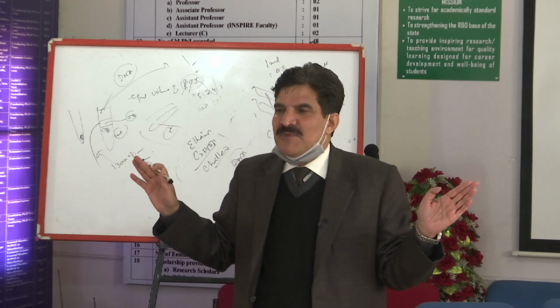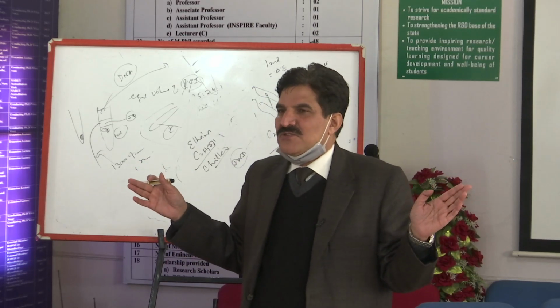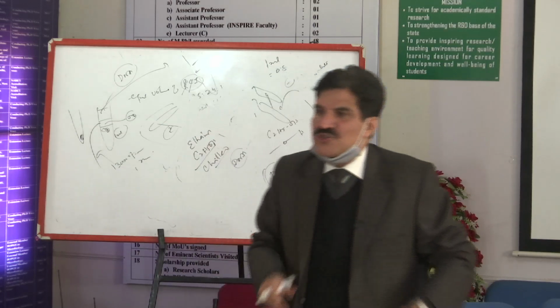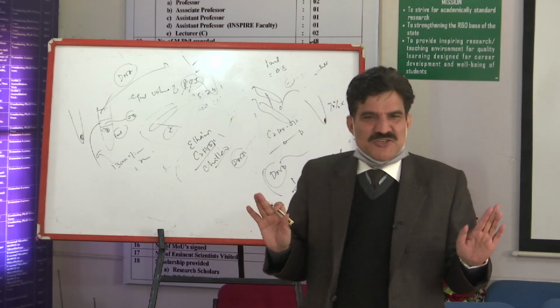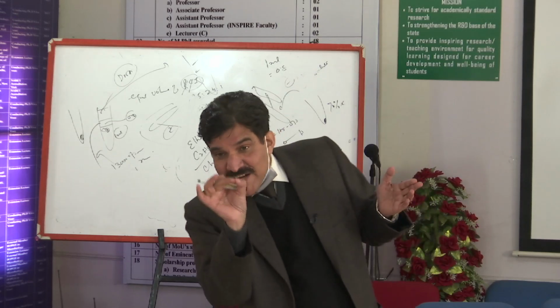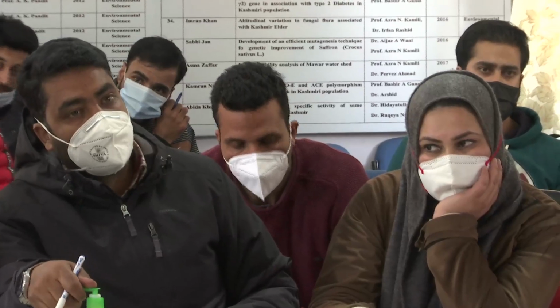It is not the way, because no solution is a real solution, an ideal solution. So there is sometimes contraction because of hydrogen bonding, volume is then becoming less. So the total should be 1, total should be 100 ml. Whatsoever it may be, no hard and fast, not too much deviation, because we require it from 65 to 75%. The 30% water which is present within the system is removing salts, and 70% alcohol is keeping this DNA intact as a precipitate. Is it clear?